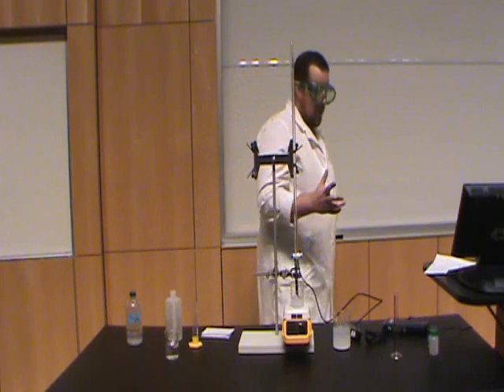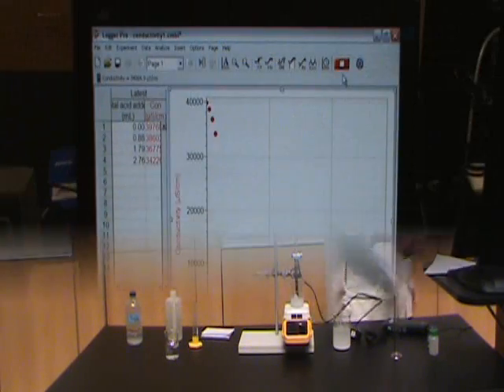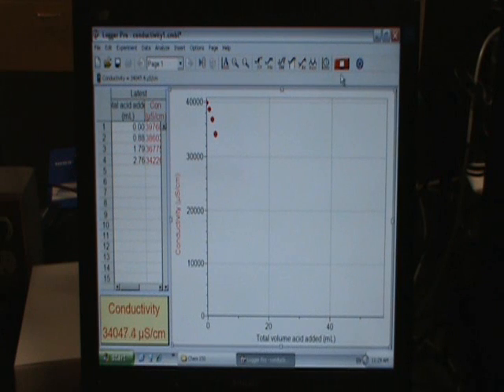Now, a couple little things on the computer that might help us out. If you hit stop before you're finished with the entire experiment, you have to start over all the way from the beginning. So, only hit keep as you continue collecting through your data set.